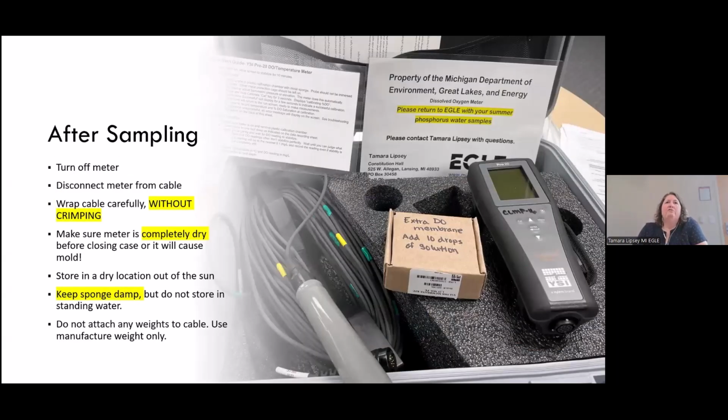So now you've already taken all your samples, and you've successfully gotten a profile for your lake. Now there are some important things to do after the sampling that are just as important as the sampling itself, because we want to protect these expensive meters and keep them in good working condition.